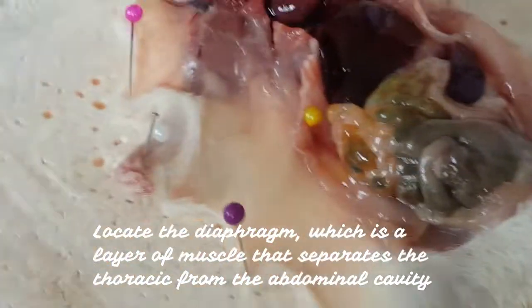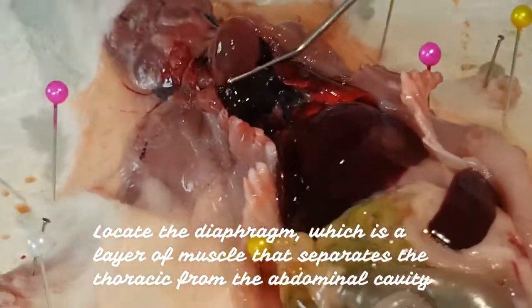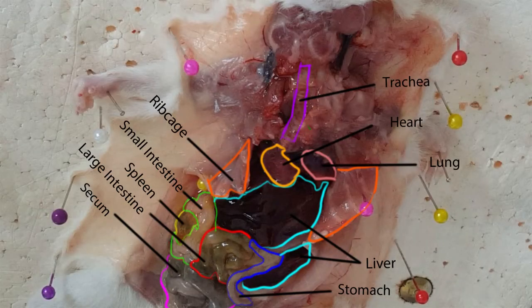Locate the diaphragm, which is a layer of muscle that separates the thoracic from the abdominal cavity. The heart is centrally located in the thoracic cavity. The two dark colored chambers at the top are the atria, or single atrium, and the bottom chambers are the ventricles. The heart is covered by a thin membrane called the pericardium.